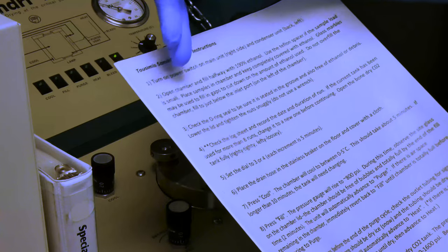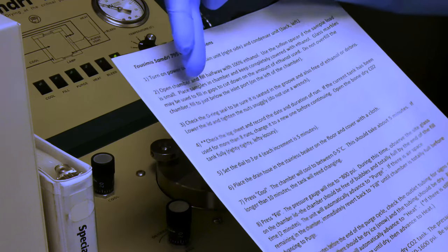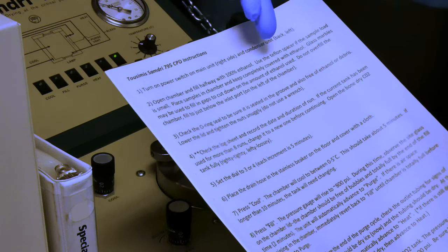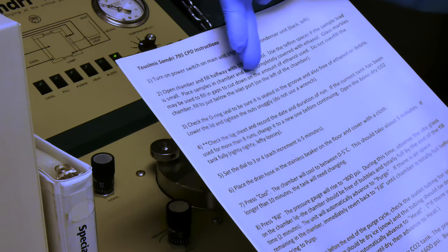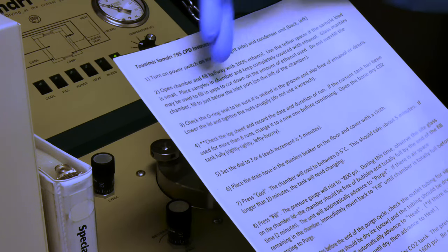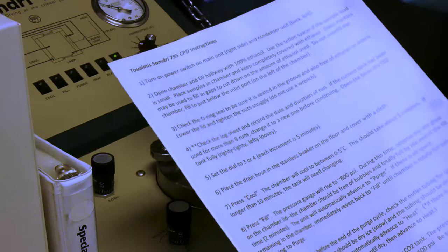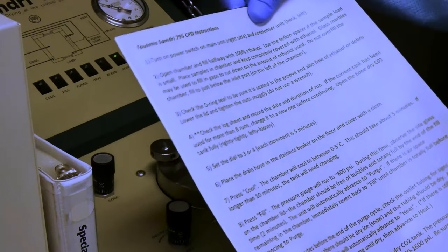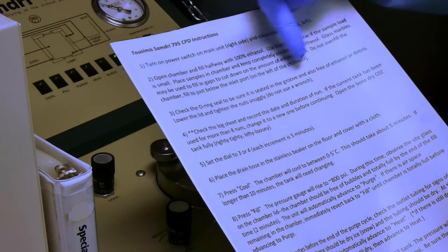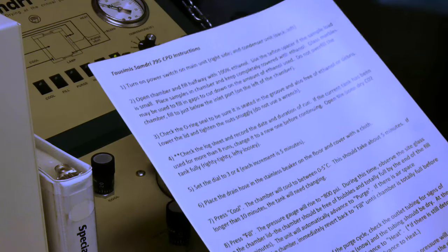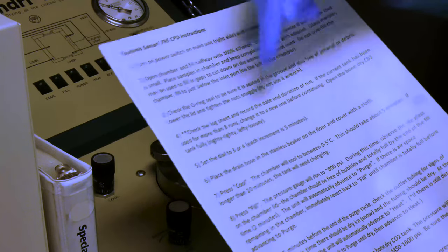So we have worked on step two by opening the chamber, filling with ethanol. We've used this Teflon spacer. We've placed the samples in the chamber and have covered with glass marbles and ethanol. We used that to bring the ethanol volume just beneath the inlet port, which is on the left side of the chamber. We've also completed step three where we've checked the O-ring seal to make sure it is seated in the groove and free of any debris or ethanol. We've lowered the lids and tightened the nuts snugly. We're going to check the log sheet.